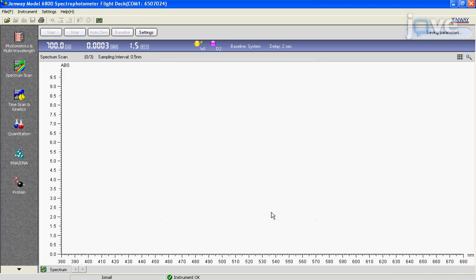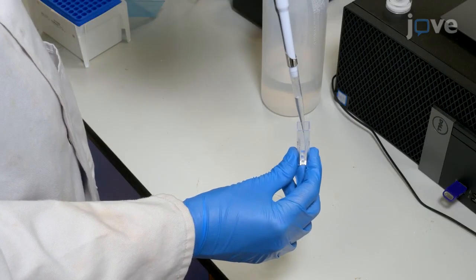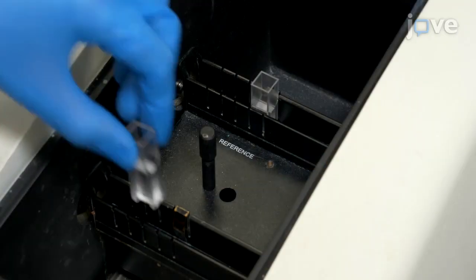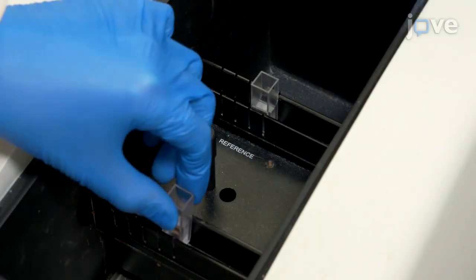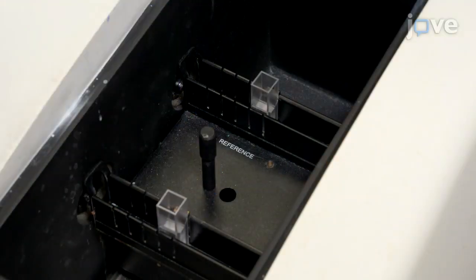After setting the parameters, fill two cuvettes with 1 mL of ultra-pure water and place them in the reference and sample cell holder to cover the light path.